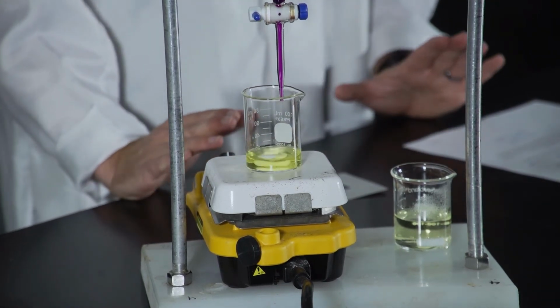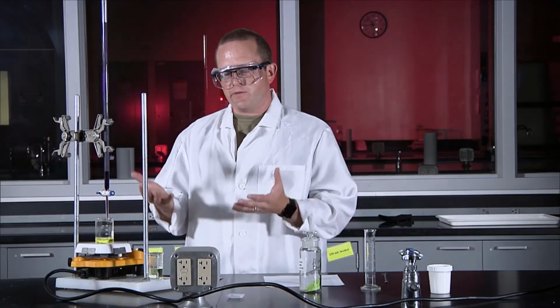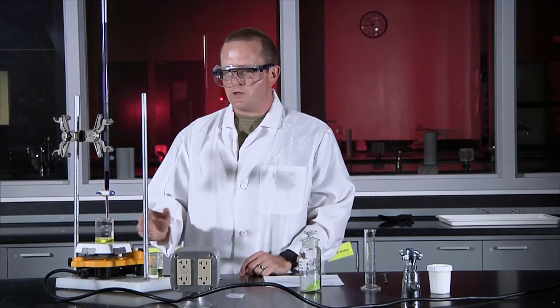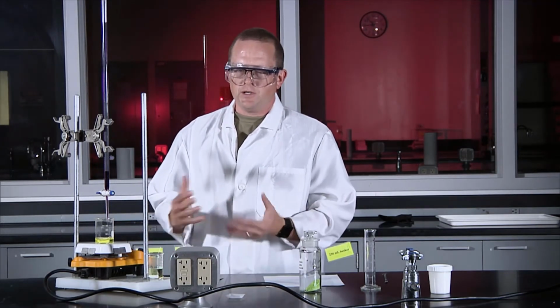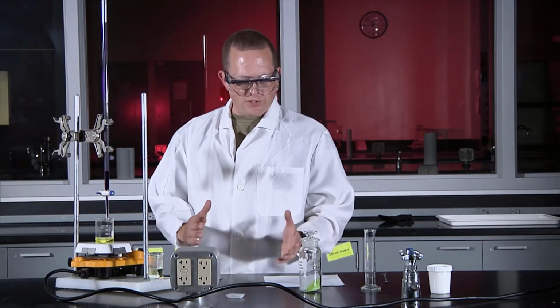But as soon as you see condensation forming, some of that is evaporating. As soon as you see that, you need to turn the heat all the way off, or else you'll get some side reactions that will lead to an inefficient reaction here.